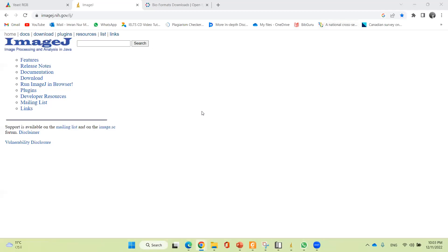Hello and welcome to today's tutorial. I'm going to demonstrate how you can use ImageJ software for copying the image, applying a scale bar, and how you can mark the colored image.